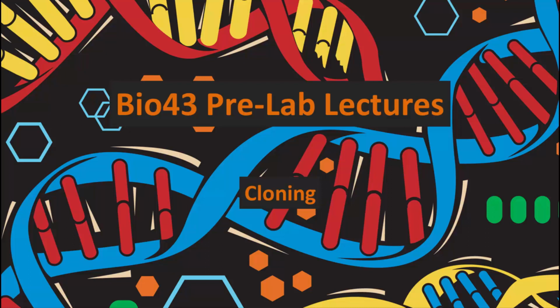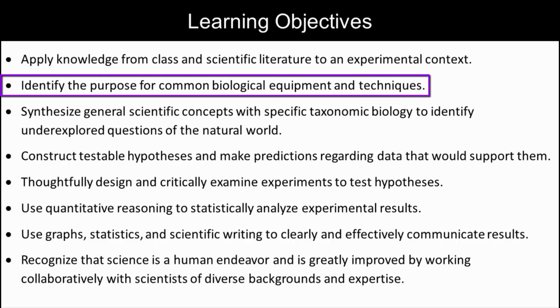Hello and welcome to the penultimate Bio43 pre-lab video. This week, we'll go over the steps required to clone your gene of interest and use some computational tools that are important for planning out the cloning process.